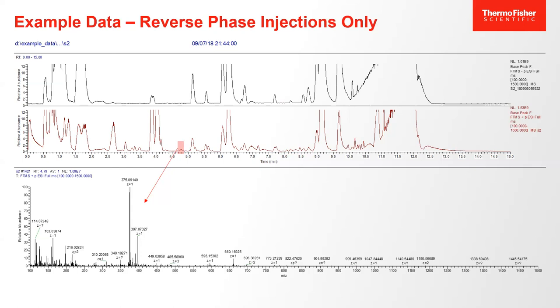Okay. Customers ask me, Craig, why haven't we gone to low flow? The problem in metabolomics is not sensitivity, it's dynamic range. Okay. If I can't take this sample and dilute it to see these little peaks because my other peaks are still flooding the chromatography. Okay, metabolomics generally have plenty of sample. Dynamic range is tough. Okay. Right now I'm solving about four orders. People are claiming six. Six I can do in a targeted experiment. And data dependency, about four. Pretty reliable with data that I'm not embarrassed of. Okay.